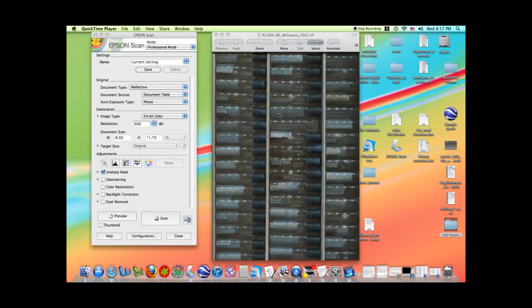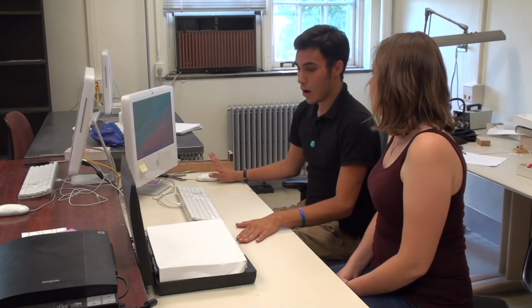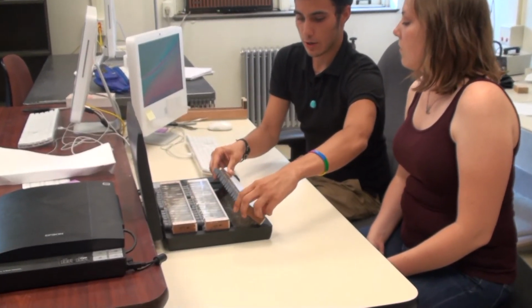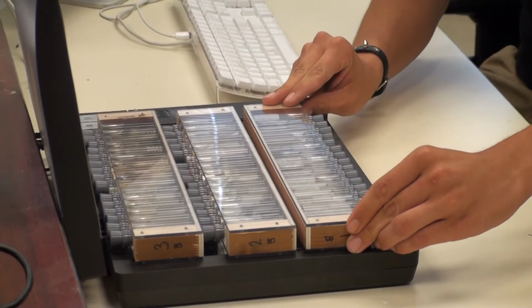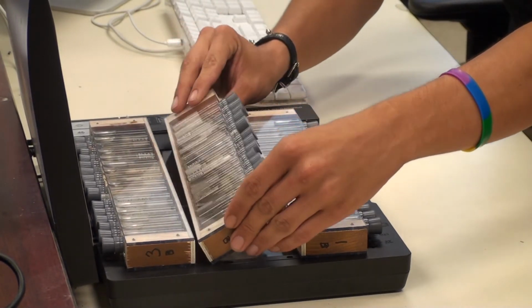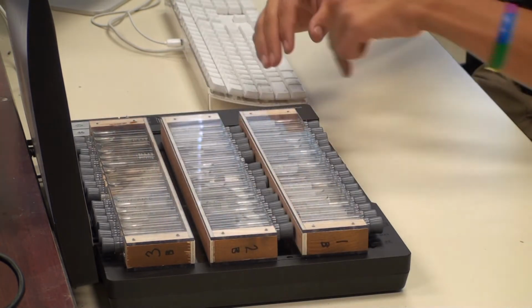Here is our first image. Okay. Now that we've gotten the front side of the vials, we're just going to flip them 180 degrees to get the other side of the vials. As you can see here, we're maintaining all the labels on this side, so now we can get, in a lot of cases, images of the specimens as well as any remaining label data. If you want to flip that one, you can.